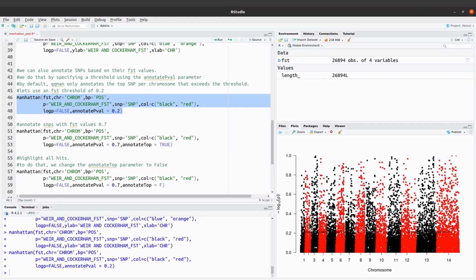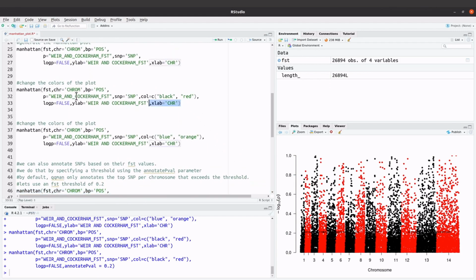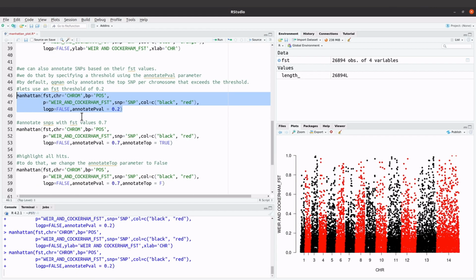Nice. So you can see some text here. These are the SNP names. Maybe you may not have noticed. Let's just run again. Let's do this first, and then let's run that code again. This one, the one to annotate the SNPs. Perfect. So you can see them here.